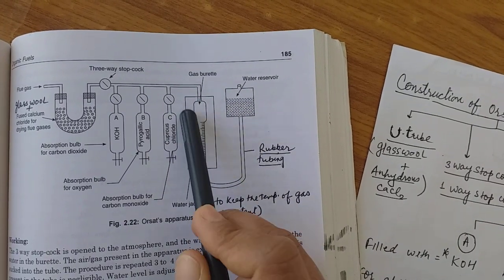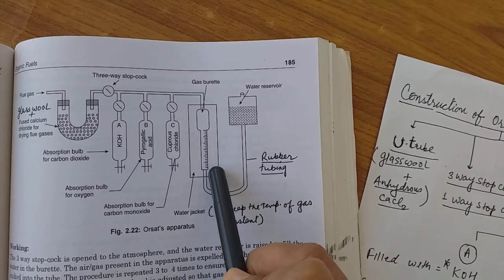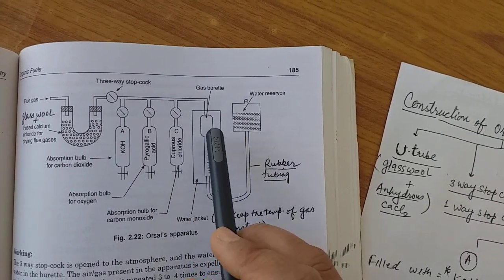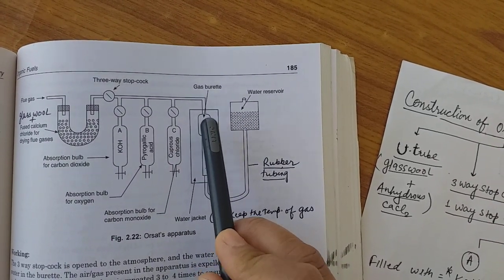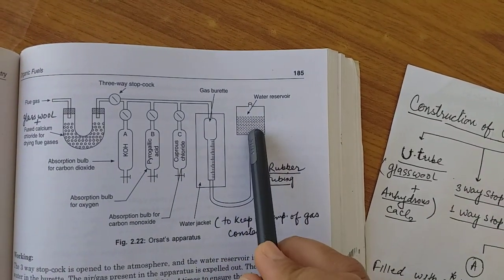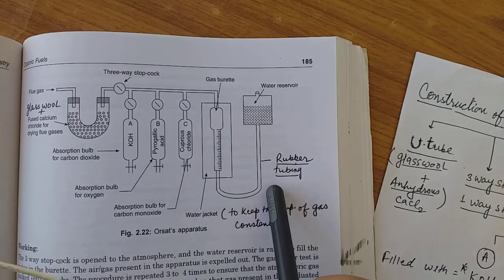Now here this is a gas burette which is surrounded by the water jacket, because gas expands with the temperature changes. Therefore, for maintaining the temperature of the gas same, there is a water jacket. This is the leveling bottle. This is about construction.